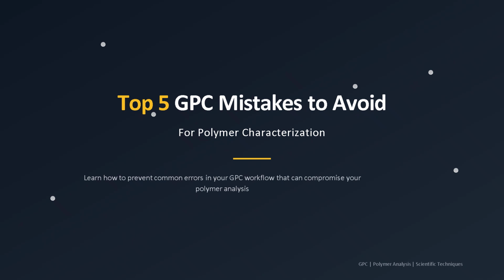If you've ever run GPC for polymer analysis, you already know it can be both powerful and a little unforgiving. One wrong assumption about solubility or calibration, and suddenly your polymer looks like it's 10 kilodaltons when it's really 200. In this video, we're going to look at the top 5 GPC mistakes researchers make and how you can avoid them to get clean, publishable molecular weight data every time.